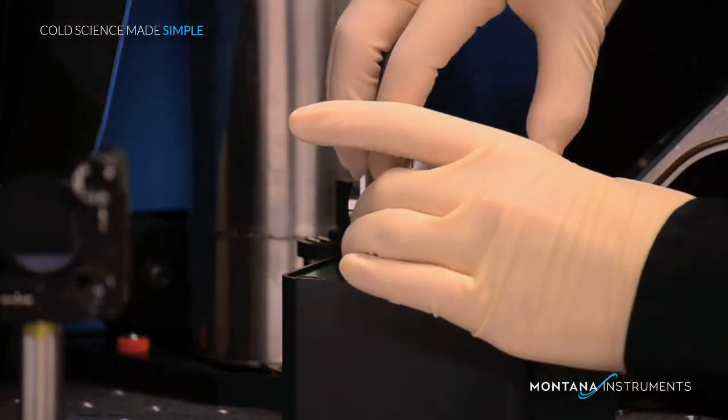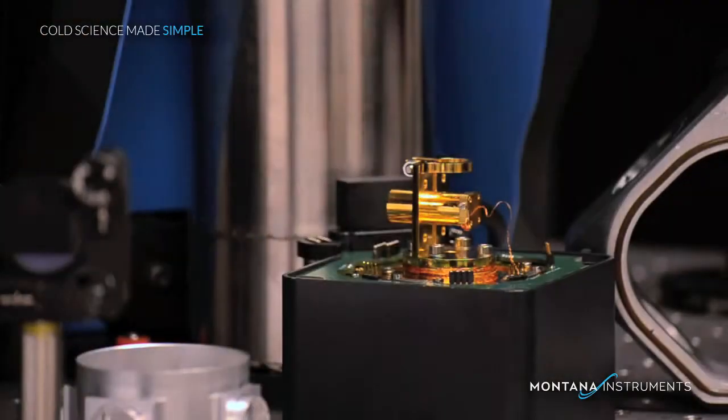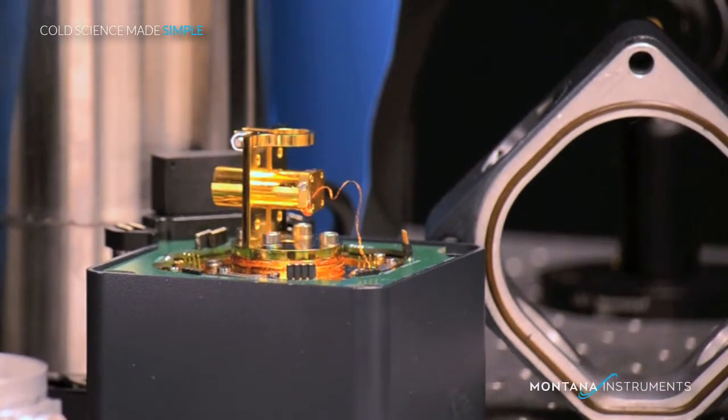We can lift off the lid now and, by removing the four bolts, we can remove the entire shield. Notice the great sample access now for setting up your unique sample and wiring.